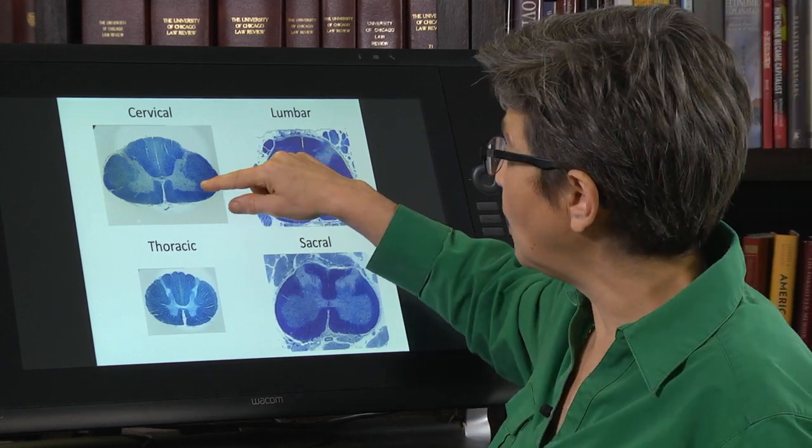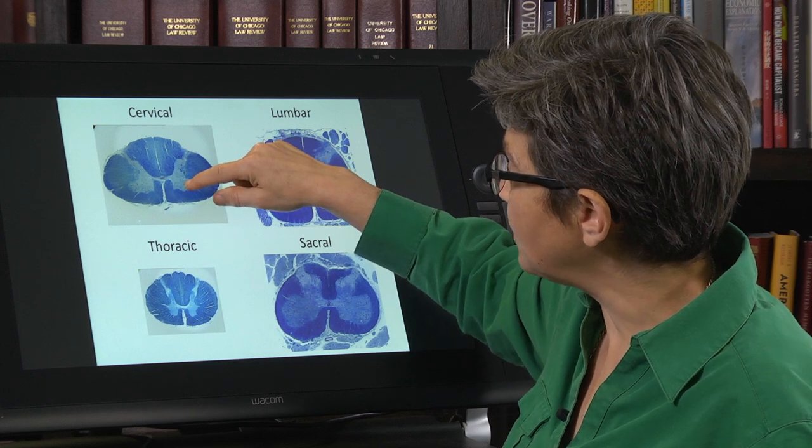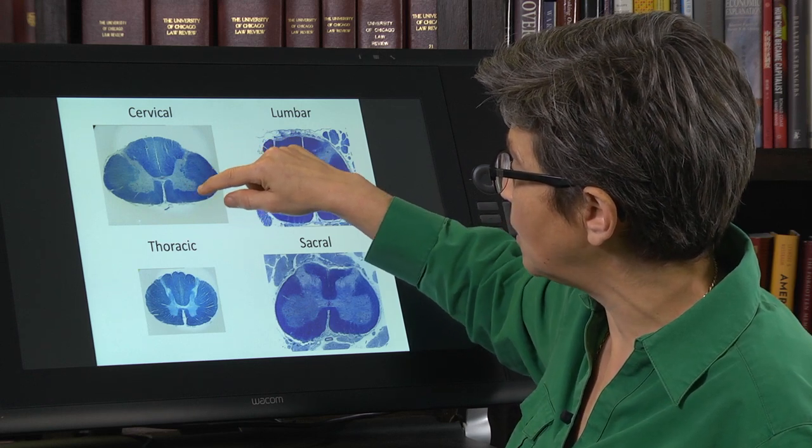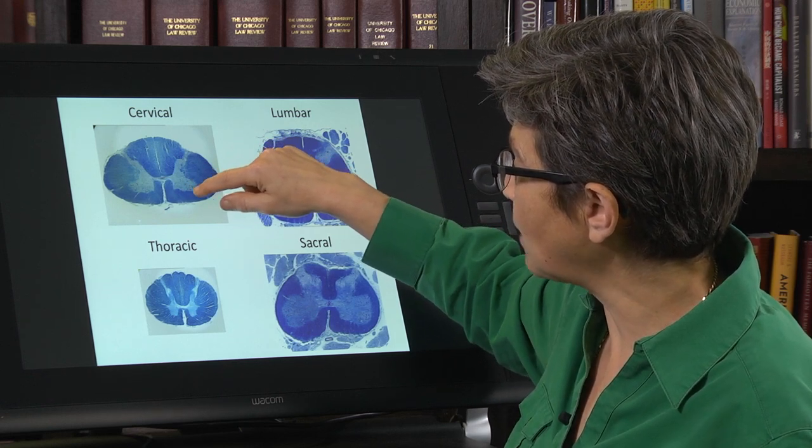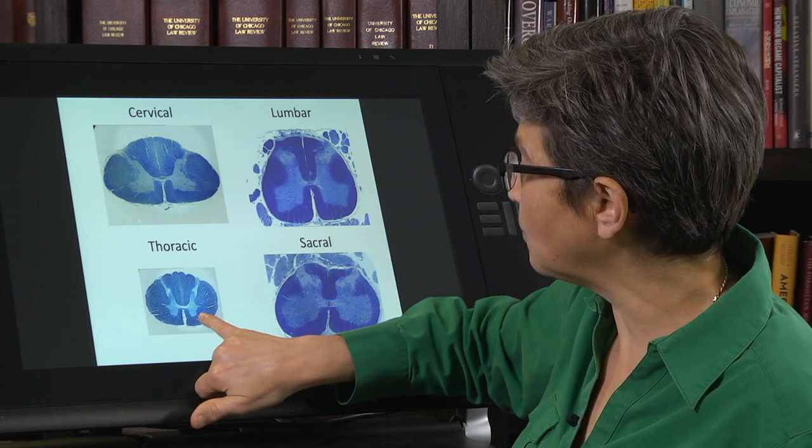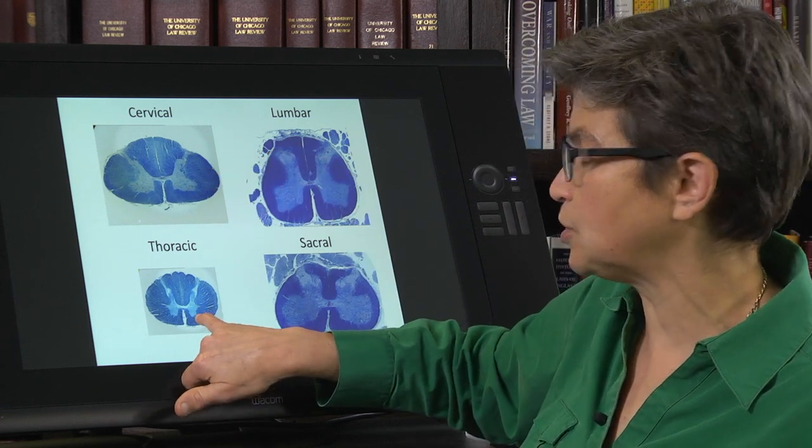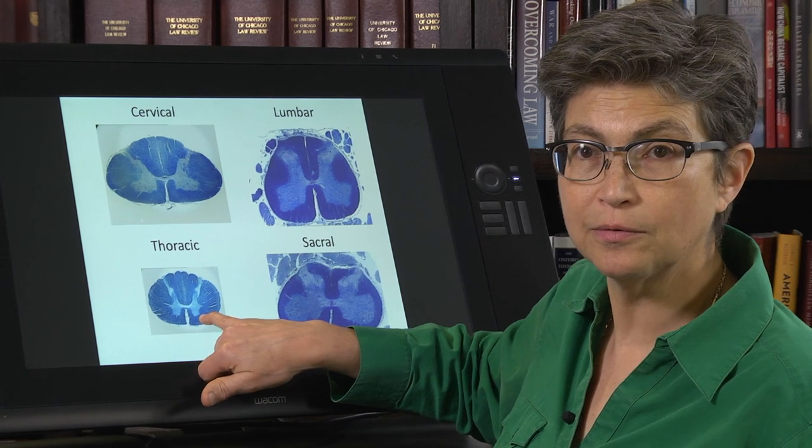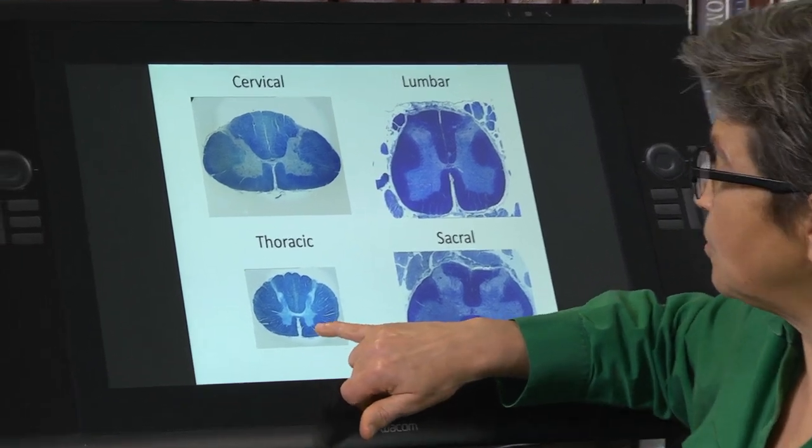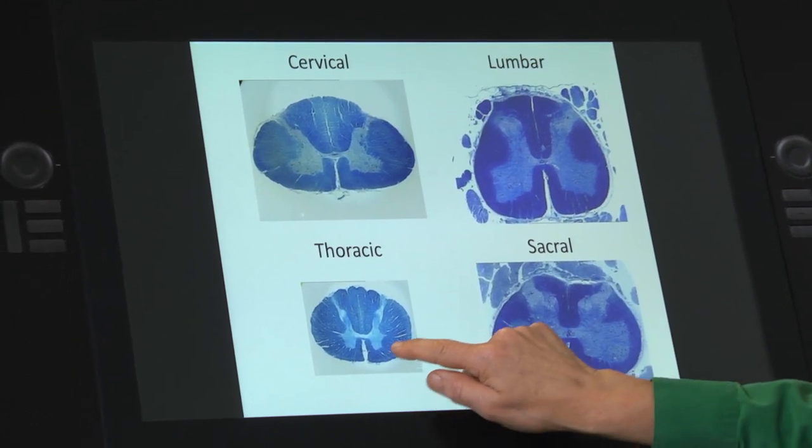So the cervical spinal cord, there's this large extension, lateral extension to the ventral horn. And then compare it to the thoracic cord, where there's just this tiny little tidbit here. Can we zoom in on that? So you see there's no lateral extension.